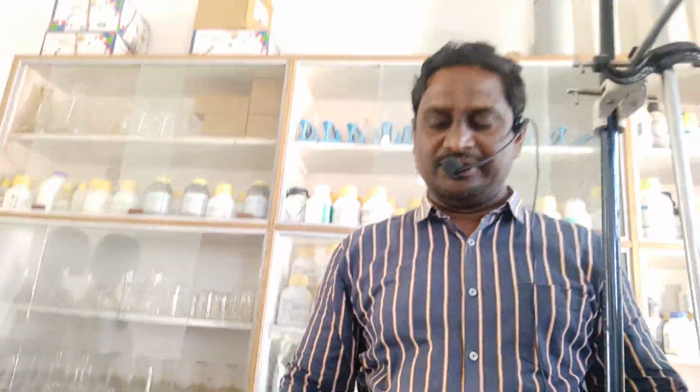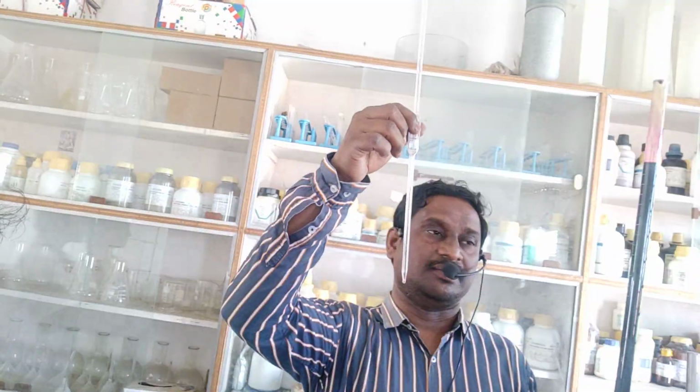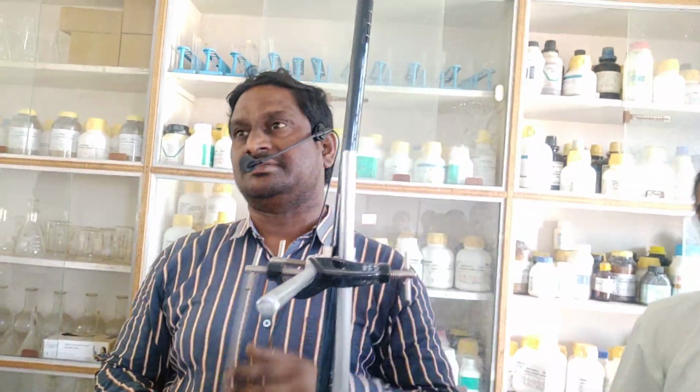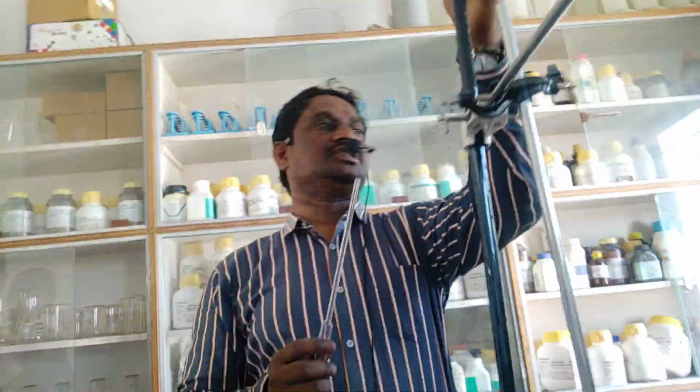Right. Now look at the procedure, all of you. First, this is a pipette. You already studied in the first chapter, some basic concepts of chemistry. These are all used for measuring the volume of liquids. If you want to measure the volume of liquids, there are some instruments.